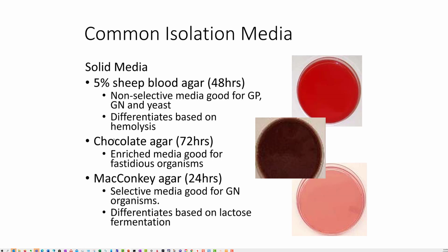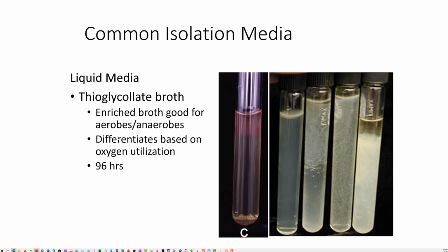And my favorite of all time, MacConkey agar. It's a selective media and a differential media built into one. It's one of my favorite plates for looking at gram negatives.